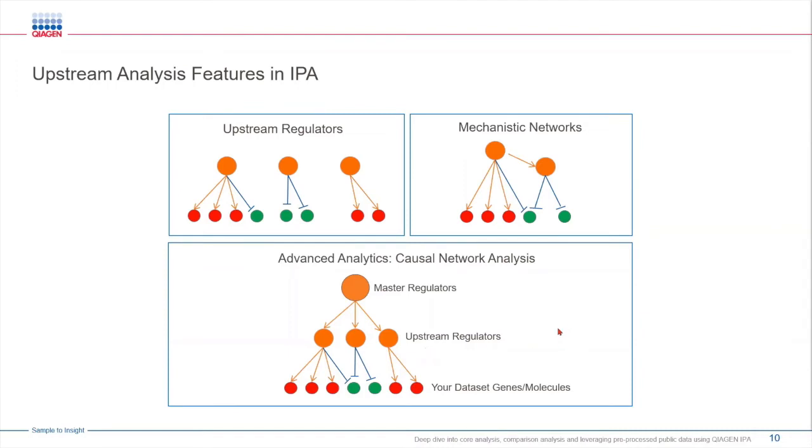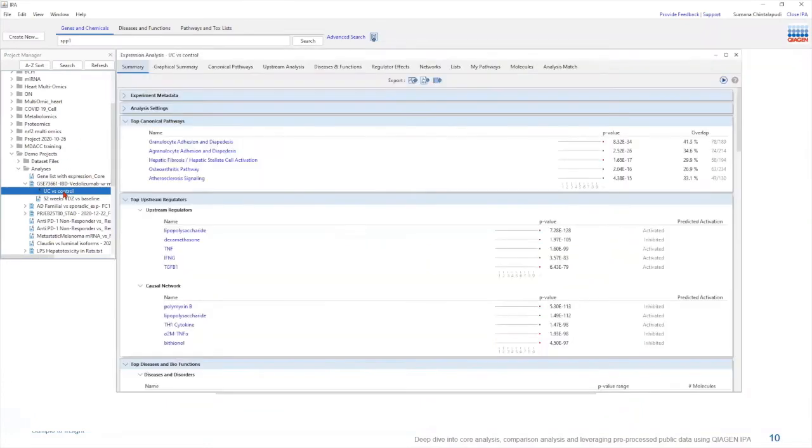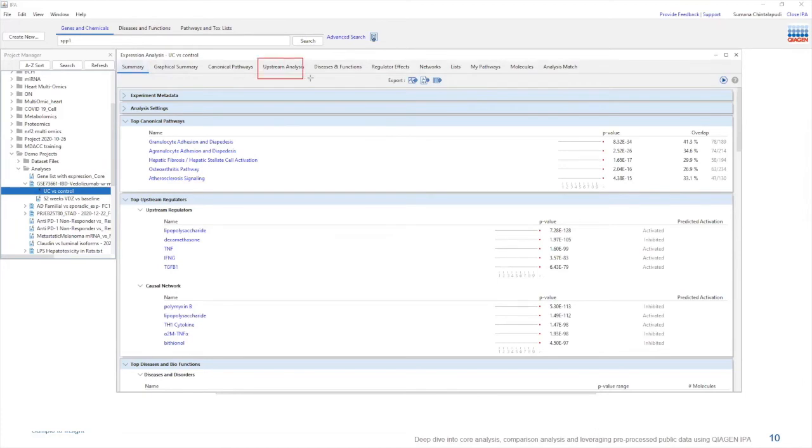Together the IPA's upstream analysis feature allows you to gain deeper insights into how regulators affect biological process in your research. So let's open up IPA. When you click on the analysis this is going to open up the expression analysis window for us. And over here we are going to go under upstream analysis.